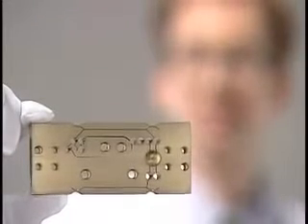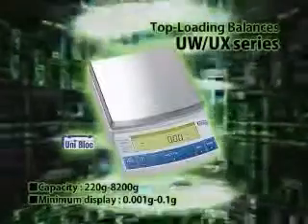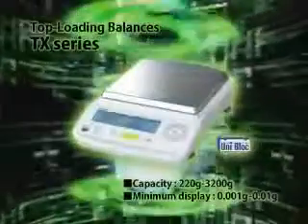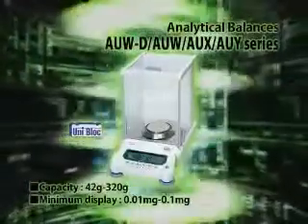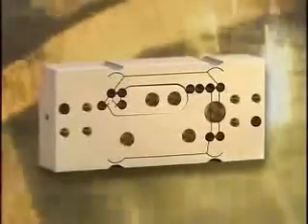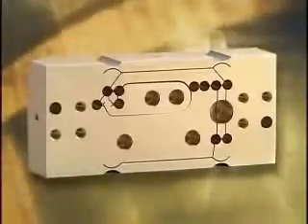Equipped with a wide range of features, the UX series is more convenient than ever to use — even with a host of high-level functions, operation is still easy. The TX series balances are a new advanced standard. The AU series semi-micro analytical balance is the world's first to use UniBlock. Providing both durability and advanced performance, UniBlock is quickly spreading out all over the world.